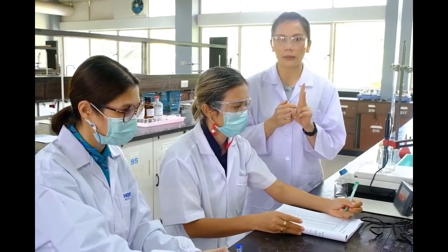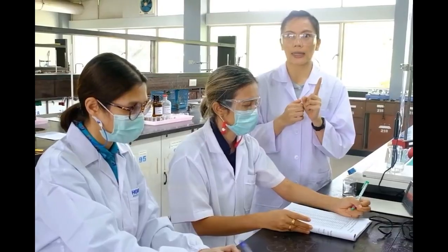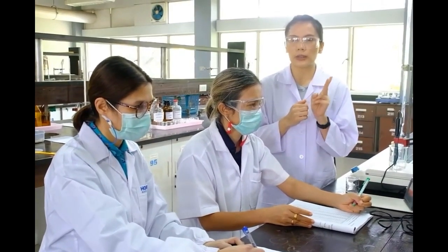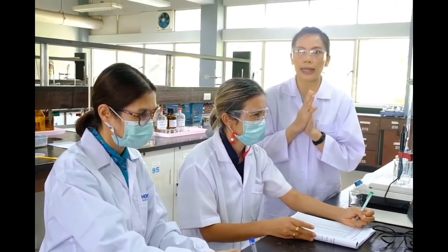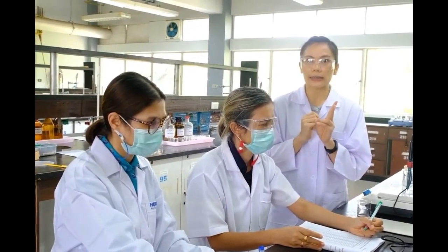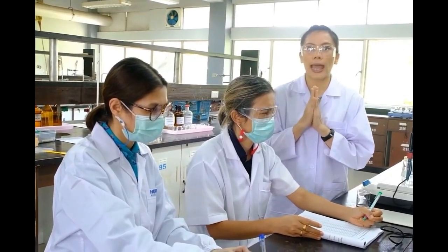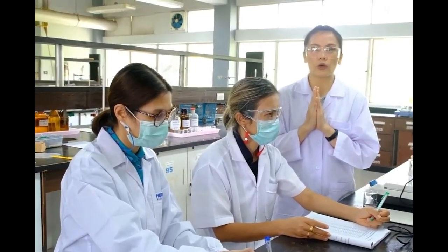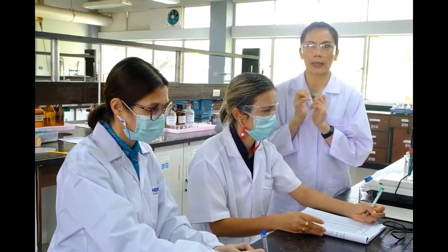The equivalence pH at point 1 will be used to calculate pKa1. Equivalence pH at point 2 will be used to calculate pKa2. Furthermore, the pH at point 2 will provide the volume, which can then be used to determine the concentration of maleic acid. Remember that the concentration of maleic acid from the bottle is written as X molar. Students must find the value of X.